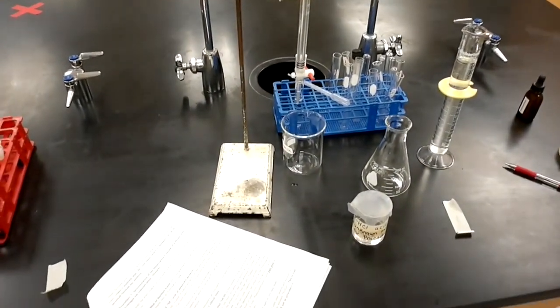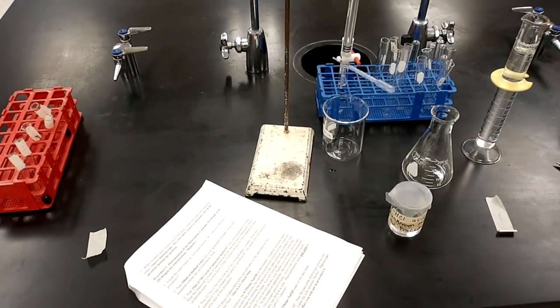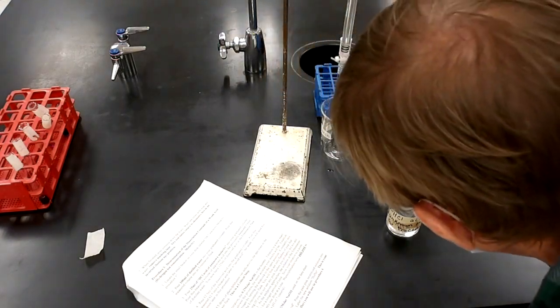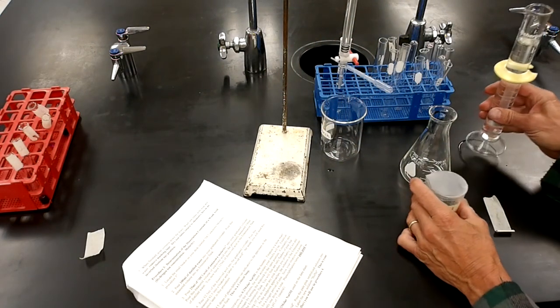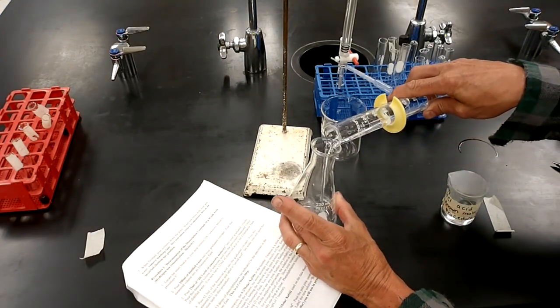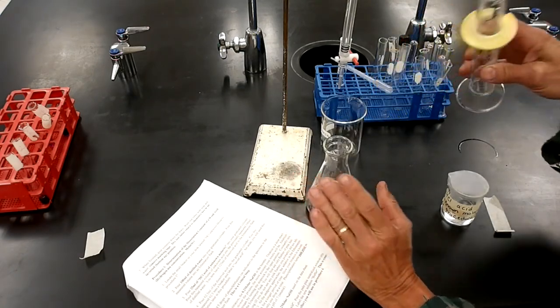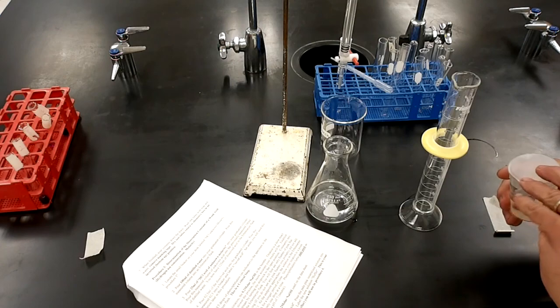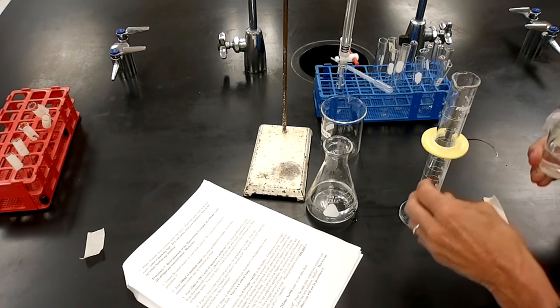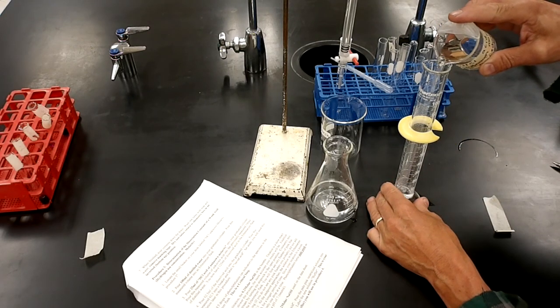So let me zoom this down here a little lower, and I'll see if I can get us going. I'll kind of talk you through it a bit. So the first thing I'm going to do, I'm going to take 100 milliliters. This is just distilled water. I'm going to pour it into this Erlenmeyer flask because I'm going to dilute the acid. Then I take this unknown acid and I'm going to measure out 25 milliliters using this graduated cylinder, which gives you a fairly accurate volume.